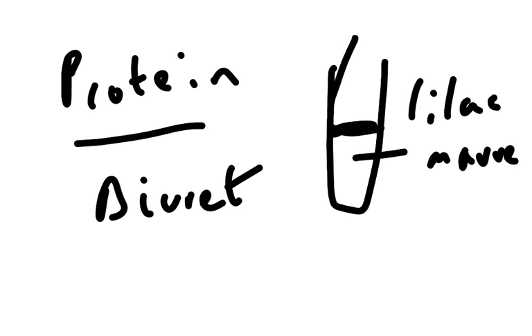If it's a negative result, it's not that there is no change, it's that the reagent remains a blue colour. It's very clear that whenever you're describing the change, you describe the change, not just say it didn't work or something.